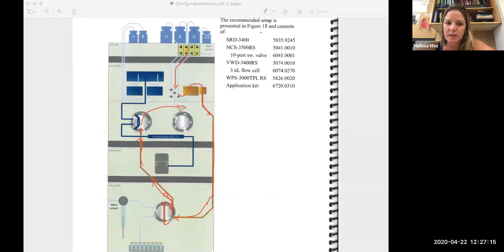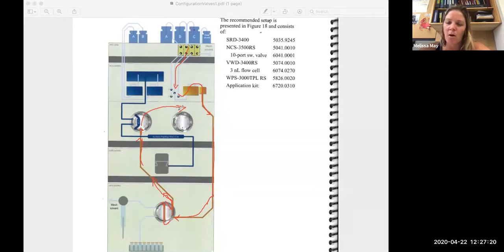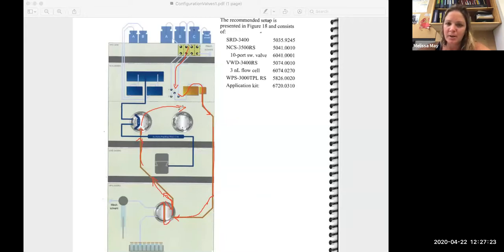So this is one of the reasons why we're running this right now that I have the loading pump turned off, is because basically all we're doing is pumping 2% acetonitrile into a waste container.